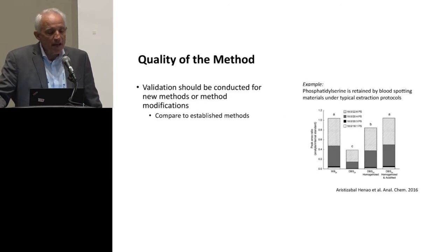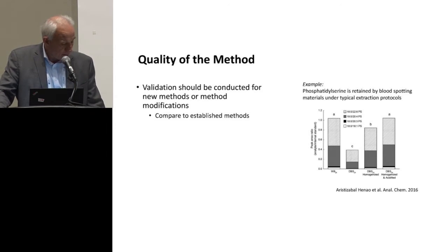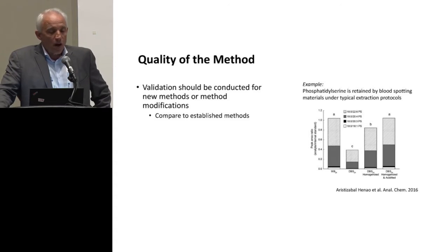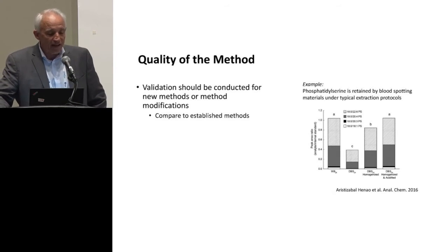The quality of the method also needs to take into account other situations as well. So particularly if this is a new method, if you're departing from something that's very much standardized, you need to validate it. You need to compare it to established methods.